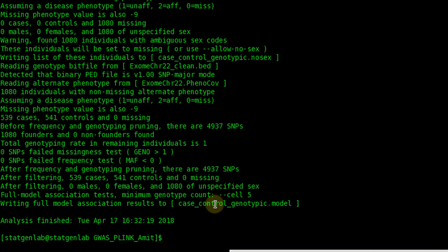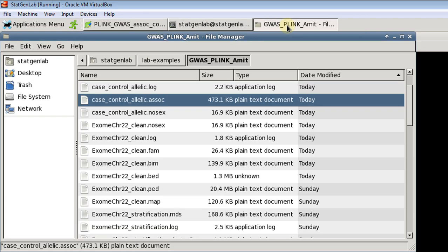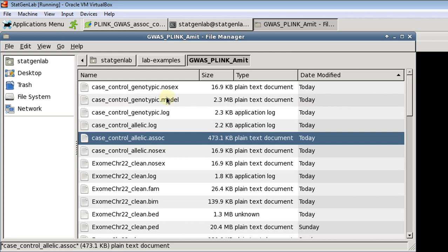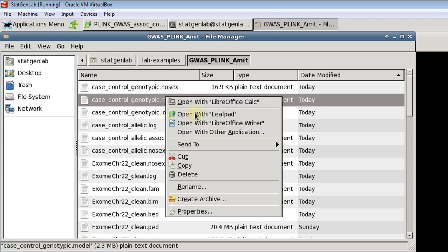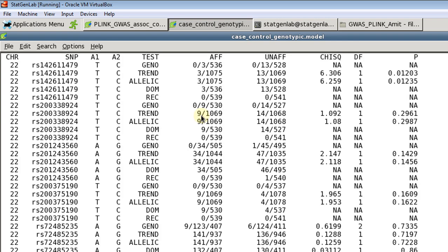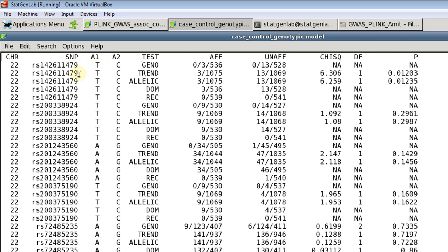And our new output file is case control genotypic dot model. Now if you take a look at this file here we see that for each SNP there are multiple lines. There are one, two, three, four, five lines for each SNP because it's performing five different tests for each SNP. And apart from what we saw in the previous file, SNP name, chromosome, allele one, allele two, and of course the test name, we also have genotypic frequencies for affected and unaffected. And again it performs a chi-square test and we get a p-value.